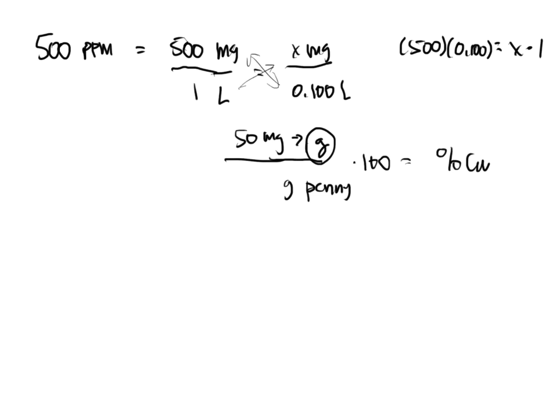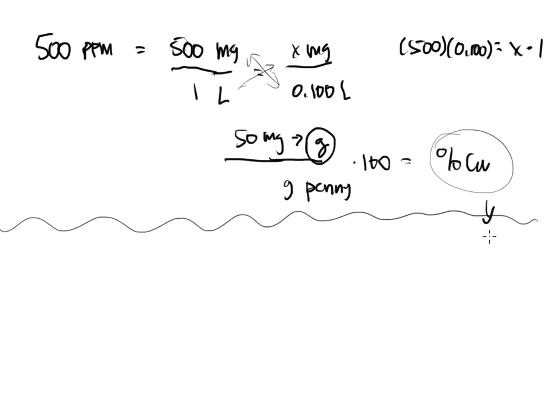All right, so that's one way. The other way that we could do this would require you to think about the 2.5%, and this will give you the percent of copper. And then you can compare that to the real percent of copper from the mint. All right, so that's how we would do percent error basically there.